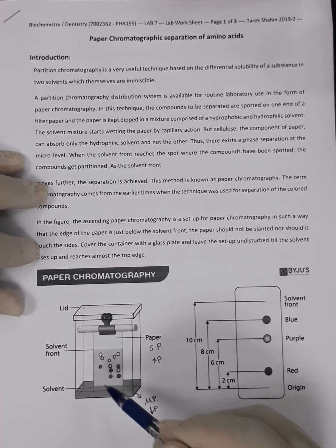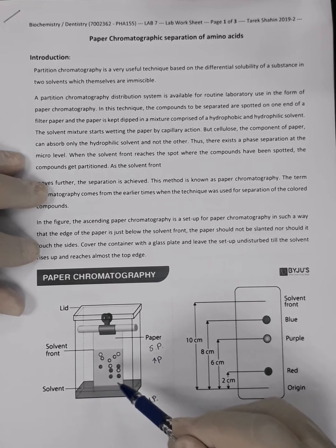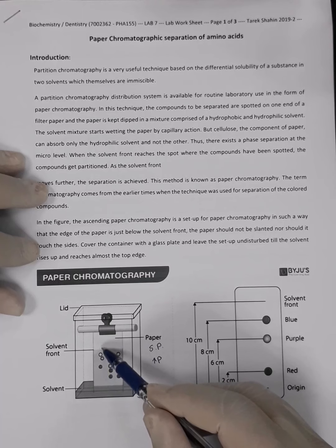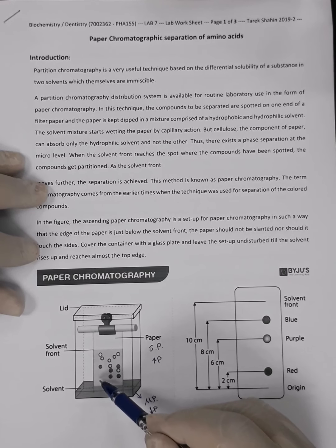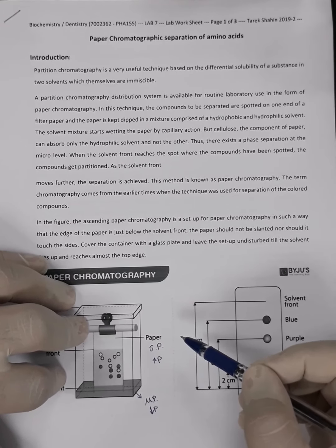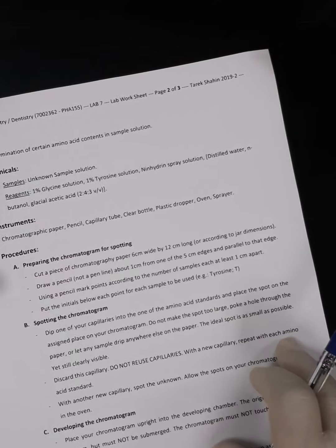So if I have a mixture of two compounds, one of them having high polarity and the other having low polarity, the low polarity compound will move up for a longer distance, while the high polarity compound will stick to the paper and will move only a smaller distance. Okay, so now we are going to find out how to do the practical of this experiment.